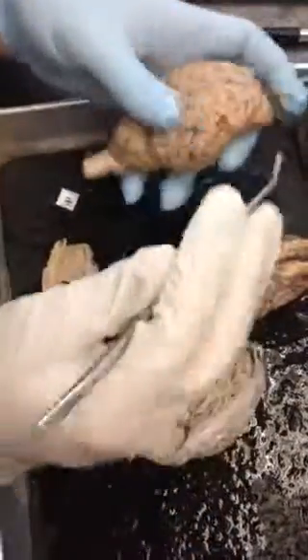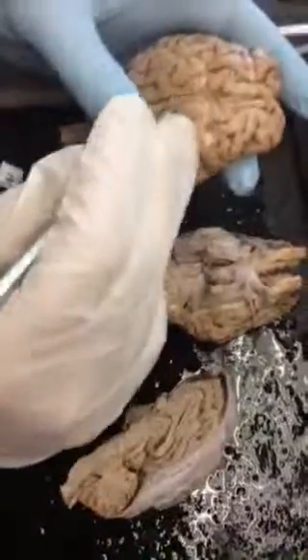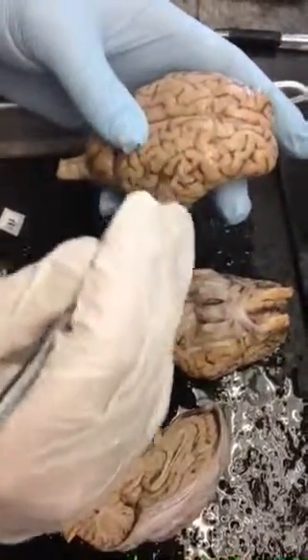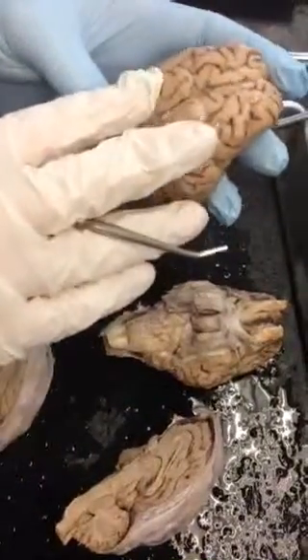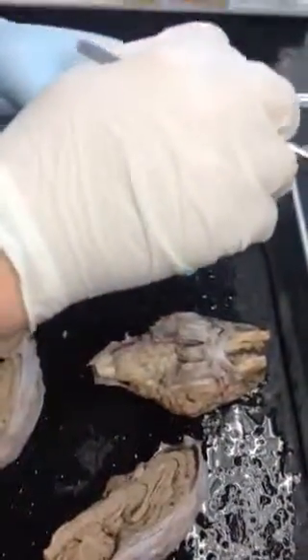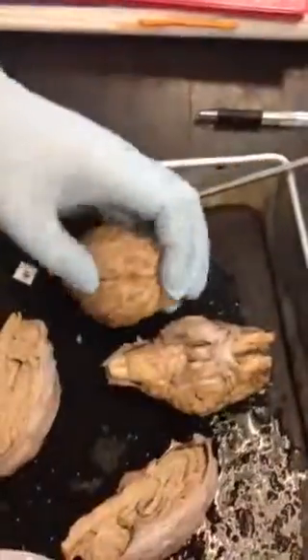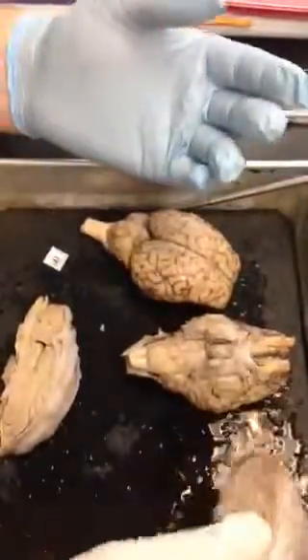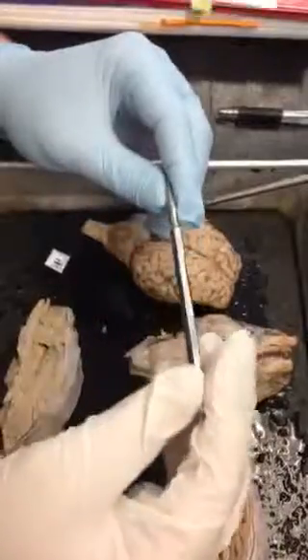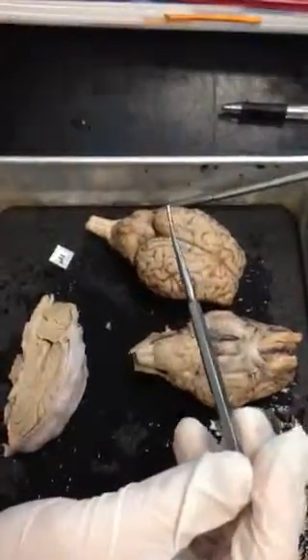Pia mater is going to be this shiny stuff. It covers the whole outside surface. I think about it as kind of like Saran wrap. It's just on there really tight. The arachnoid mater is in between the two, and it's tough to see it just looking at it right here. So we usually don't try to pin arachnoid mater and ask you what it is, unless you're evil.